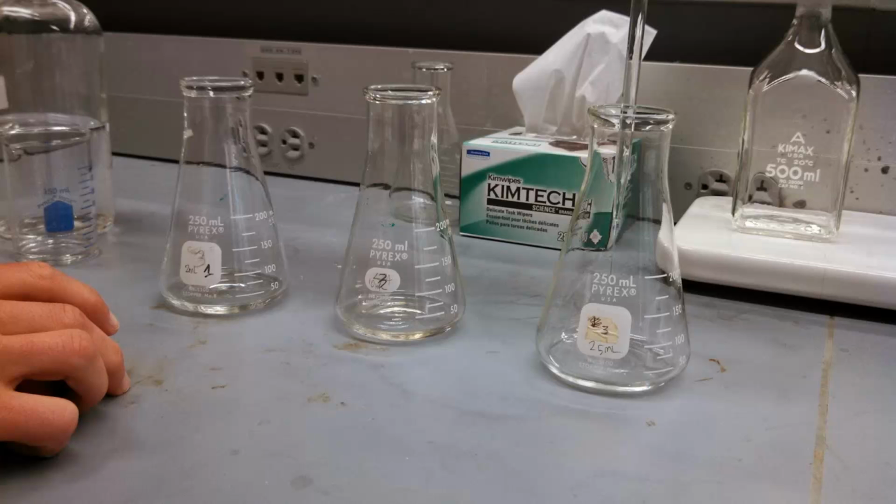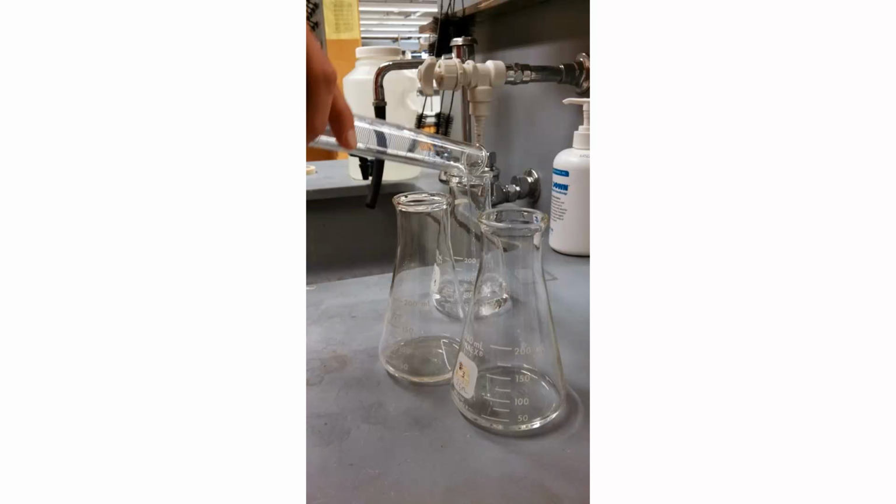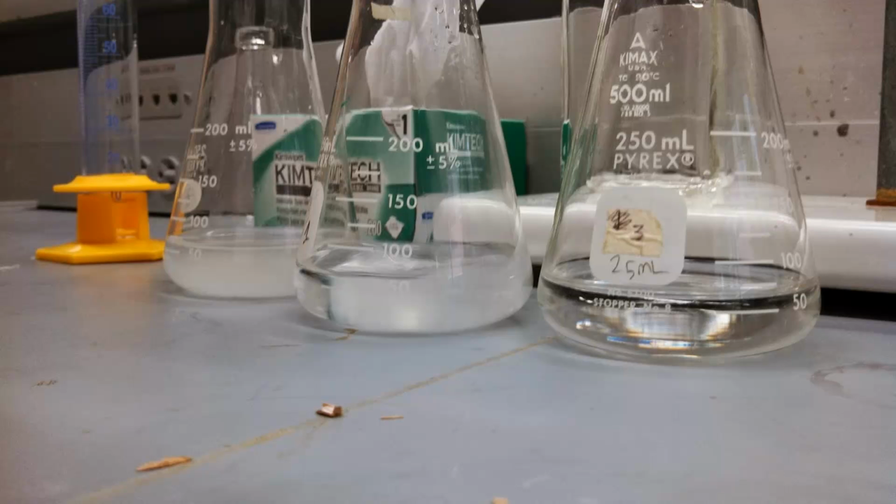The first thing you're going to need to do after you make your titrant is prepare your titration flasks. So you're going to pipette exactly 10 milliliters, or your calibrated volume, of your chloride standard into your titration flasks. You're going to add water to bring the total volume to 50 milliliters. So for your standardization, you're going to add 40 milliliters of water. For your unknown determination, when you're using a solid chloride sample, you're going to add 50 milliliters of water.